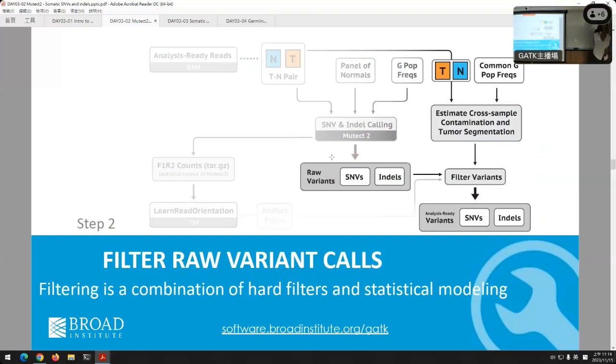At this point, we're doing even more filtering past that stage. Like I said, we want to be very careful in the somatic case. There's further filtering here. That box I mentioned was little, but there are actually several types of filtering that I'll go into in turn, okay?